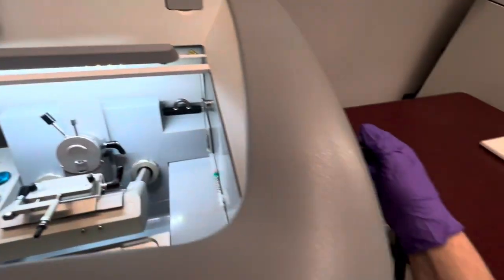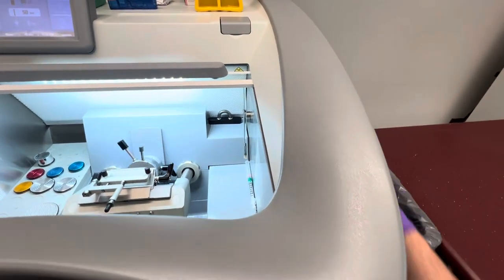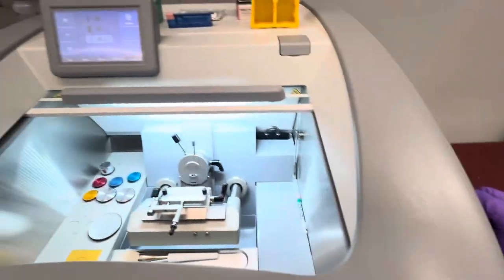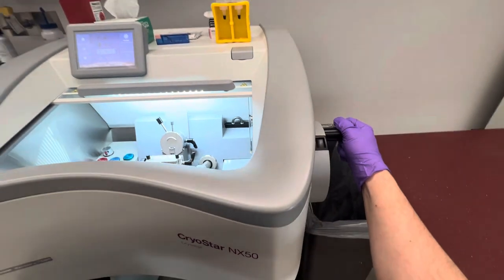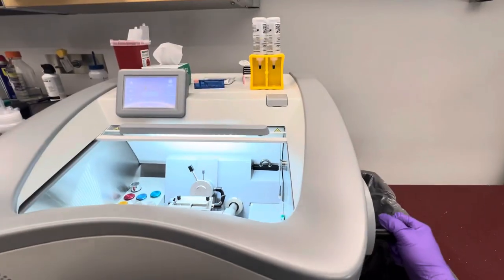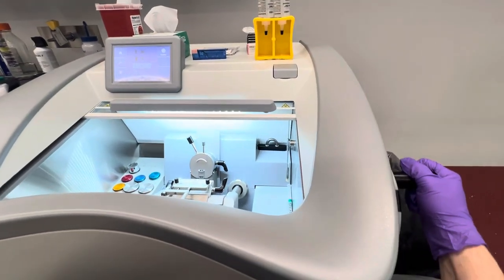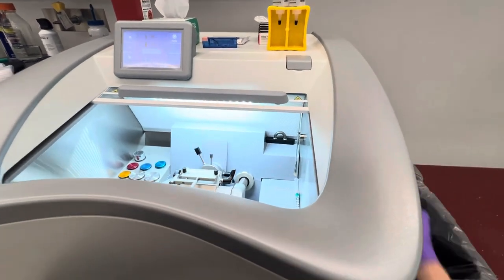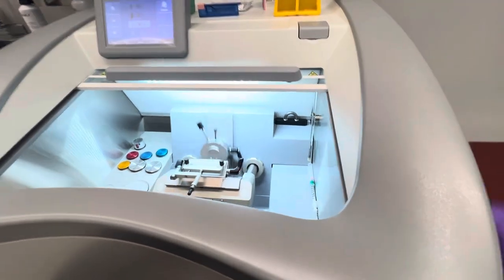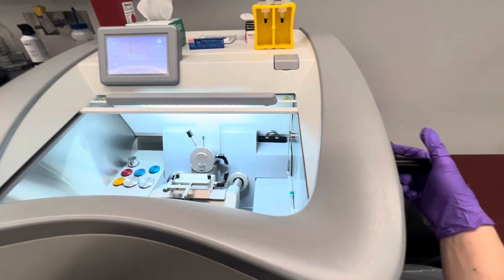And how it works is that as it goes down, that's one cut. So about halfway is cutting off the face, and then the other half is coming back up. And how you want to do this is almost as a rhythm. So you want to cut, easy back up, cut, easy back up, cut, up, cut, up, and don't just be going like that. Easy sections at a time. Cut, up, and that's kind of the rhythm you want to do with it.